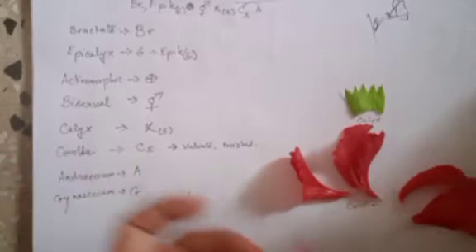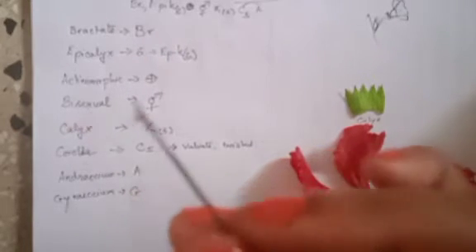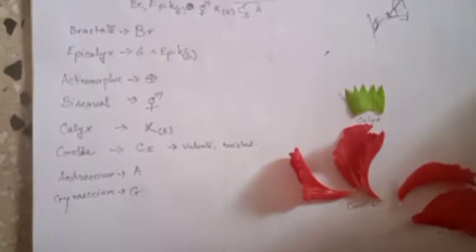So you see, these are the anthers that I've just collected now. This is the anther. So just see here. I hope you are able to see the anther. So here you have the anther. Okay. So in the anther you can see. I'll place it over here. Fine. Next, I'm just trying to remove out the stigma by making a small incision.